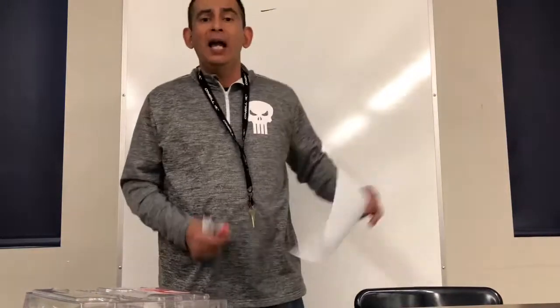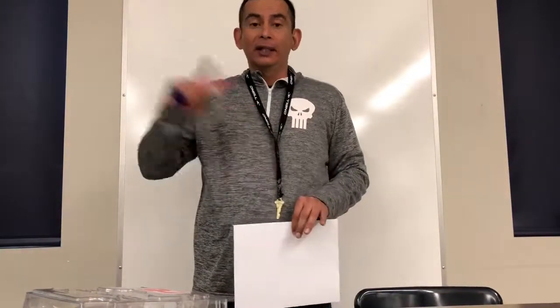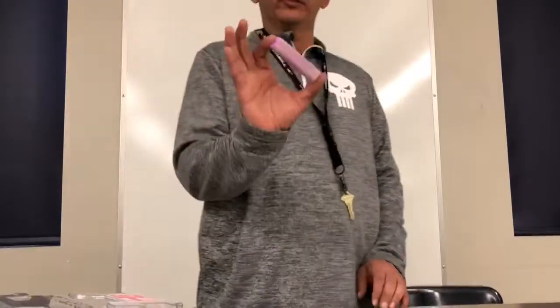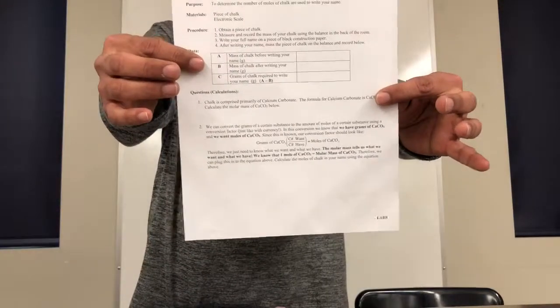So here I am, and we were doing this mole of chalk lab, and the purpose was to figure out how much chalk we left outside and then convert that number into moles. So the first thing that you're going to have to do is start with a piece of chalk. You will then have a balance and of course your lab sheet that you have already gotten.